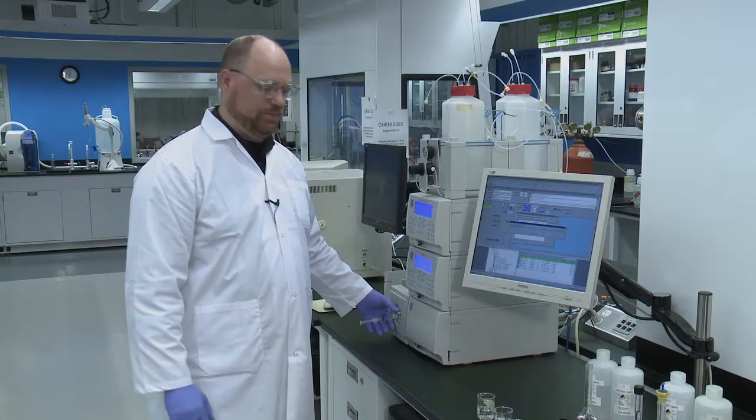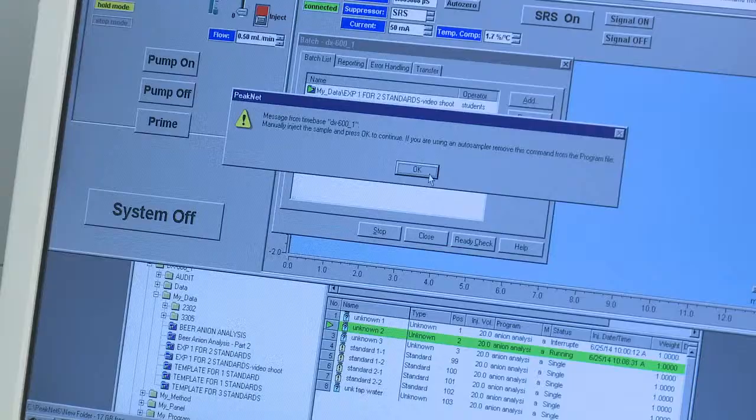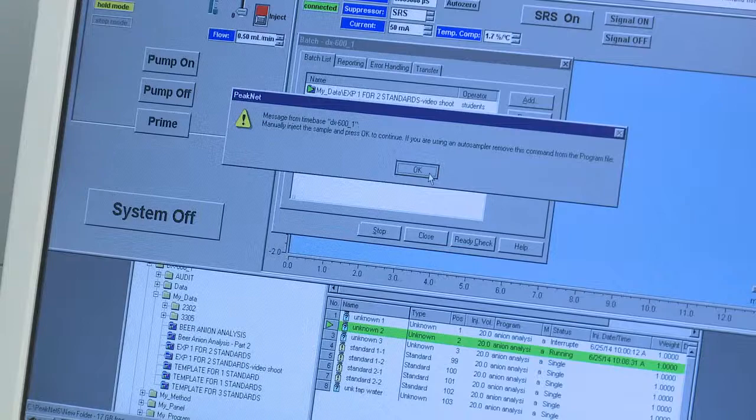So it's a bit of a stretch, but you can move the mouse over. Position the mouse. And we'll just go three, two, one, turn and click.